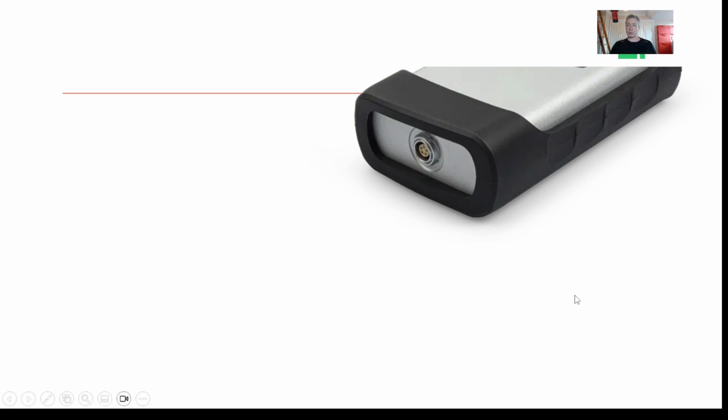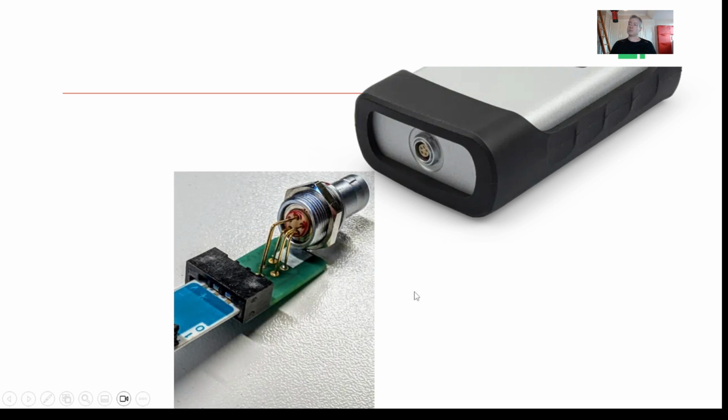Question number 3 was about a well-known potentiostat. It's not something that I support at ZP, but I've been talking to a client recently, and they're about to want to do some EIS on this instrument. They are using a particular connector that will plug into there. I just want to give people a heads up that these kinds of connectors that you see are not good connectors, especially for EIS. So if you're getting problems with your electrochemical impedance spectroscopy and you're not getting repeatability, it can come from the connectors. So be careful about connectors.